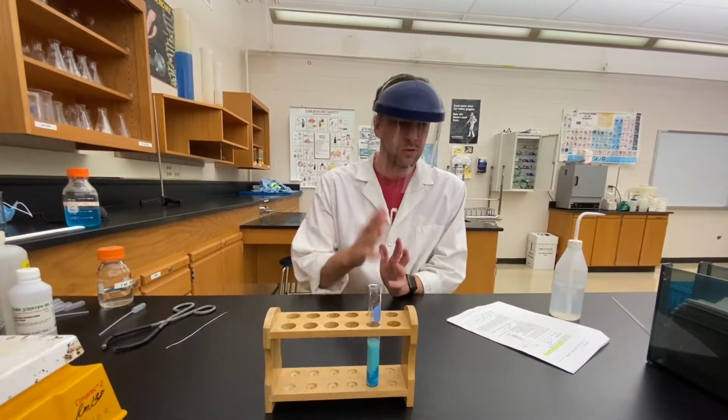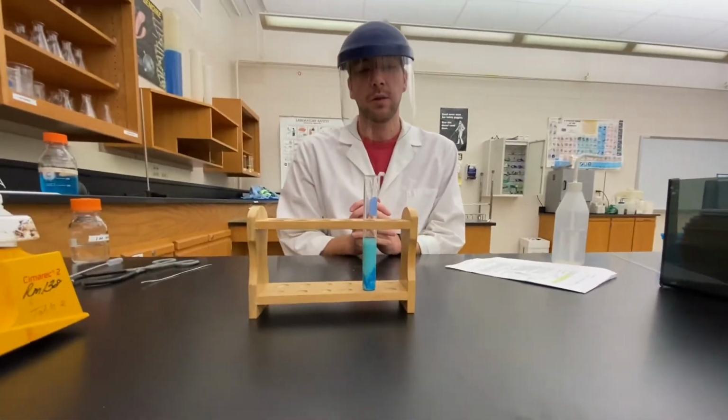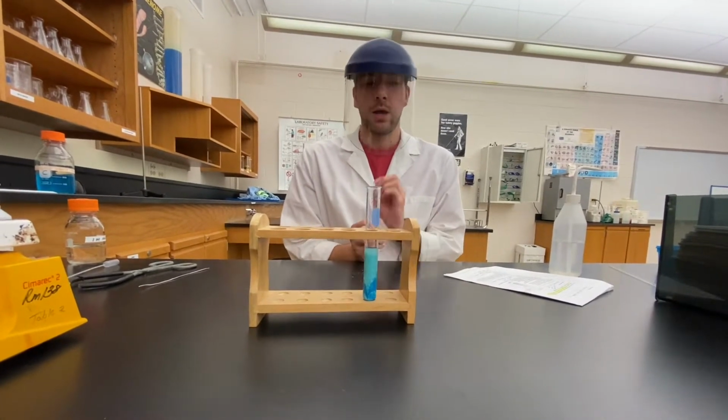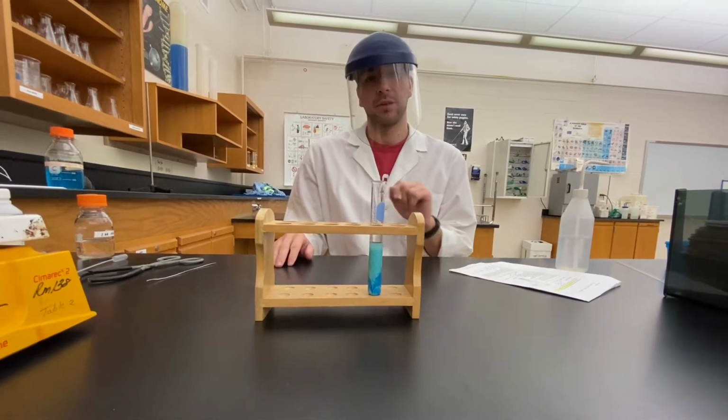Okay, so there's our first reaction. On your own sheet of paper, I would like you to write reaction number 1, and then using what I have described so far in the video, write the chemical reaction in formulas and balance it, please.